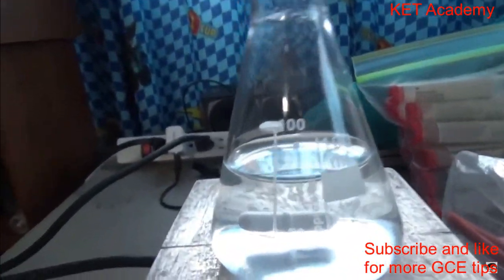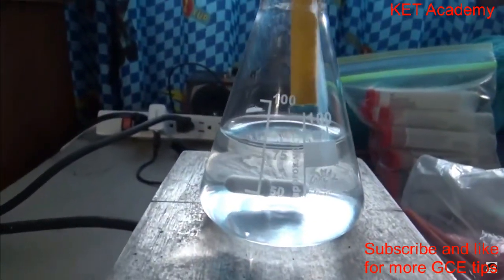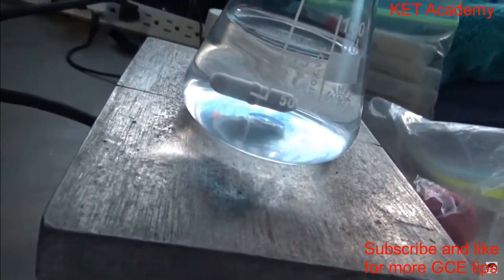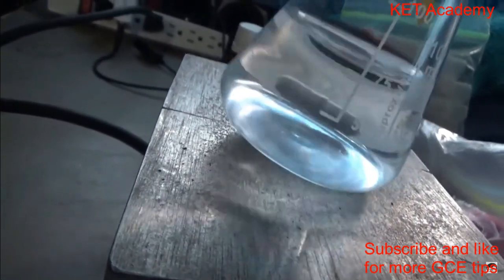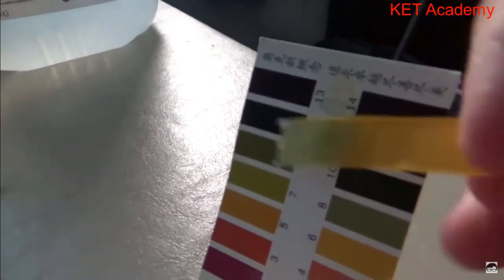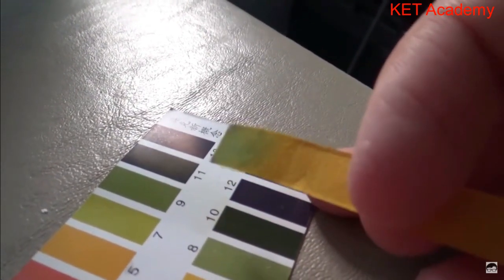Test the pH. You usually want to actually not put the pH paper in there, and you would instead want to take some of it out and put it on the pH paper so it doesn't contaminate the solution. But it's not that big of a deal. I should be using my tripod right now, but it's fine. I'm going to stick it like that. I'm going to tip this. And, okay. There we go. There it is. According to the pH paper, about a pH level of, I'd say, 9.